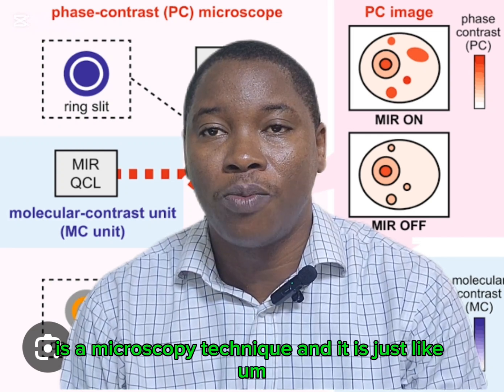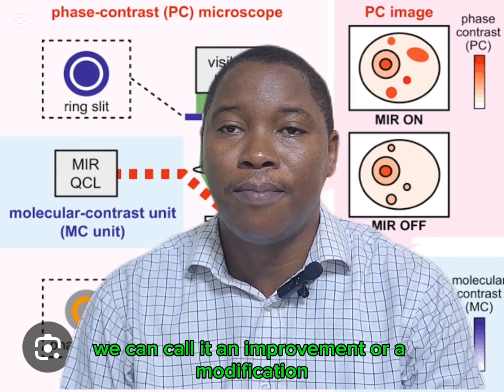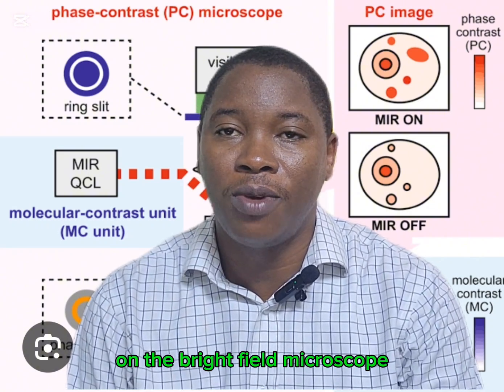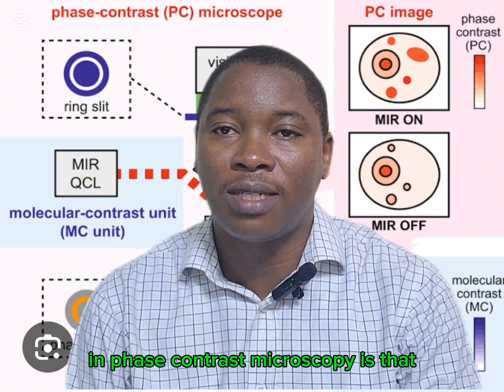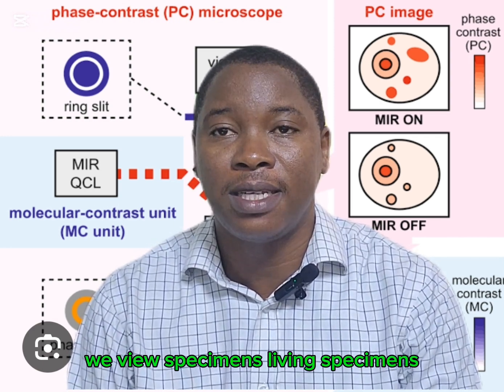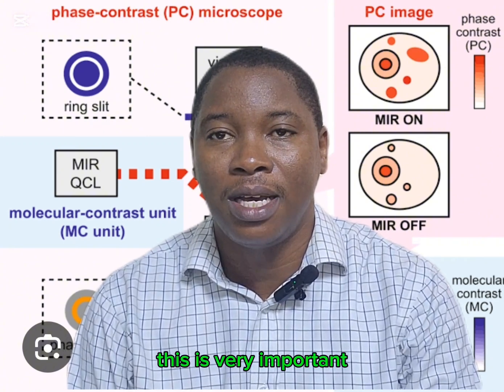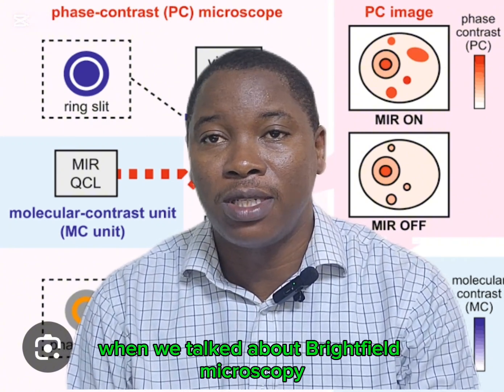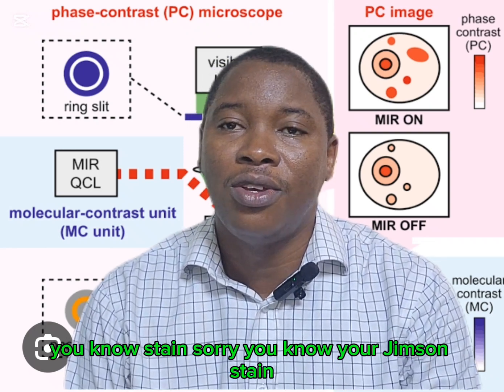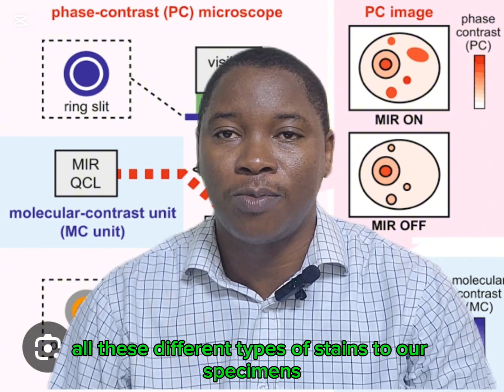It is a microscopy technique, and we can call it an improvement or a modification on bright field microscopy. Because what we do in phase contrast microscopy is that we view living specimens without staining those specimens. This is very important. When we talked about bright field microscopy, we said we apply different types of stains, your Giemsa stain, your Wright stain, all these different types of stains to our specimen.